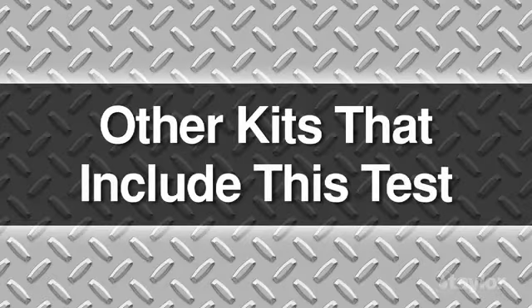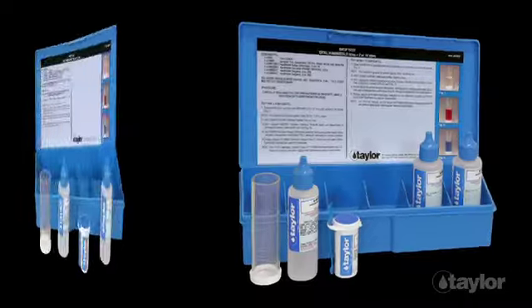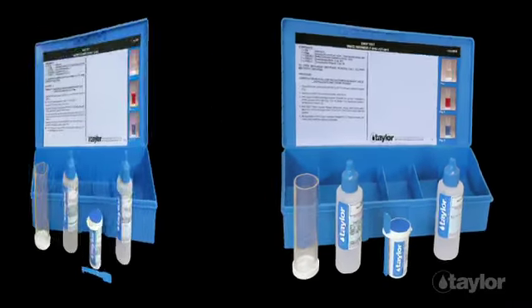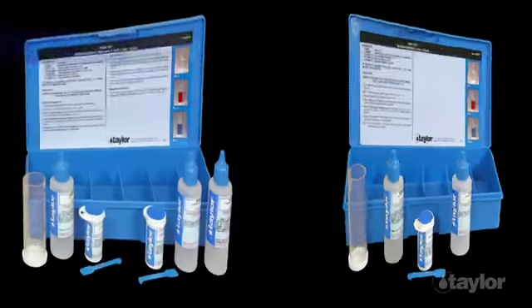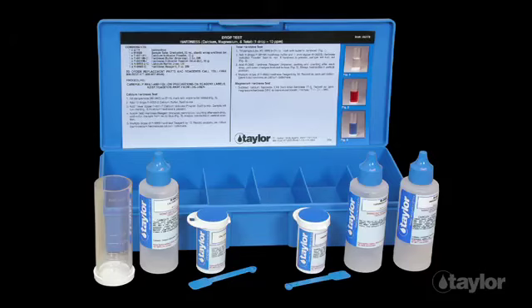In addition to K-1514, Taylor offers several other kits for determining hardness. K-1503 for testing total hardness, K-1504 for testing total trace hardness, K-1567 for calcium hardness, and K-1594 for calcium, magnesium, and total hardness.